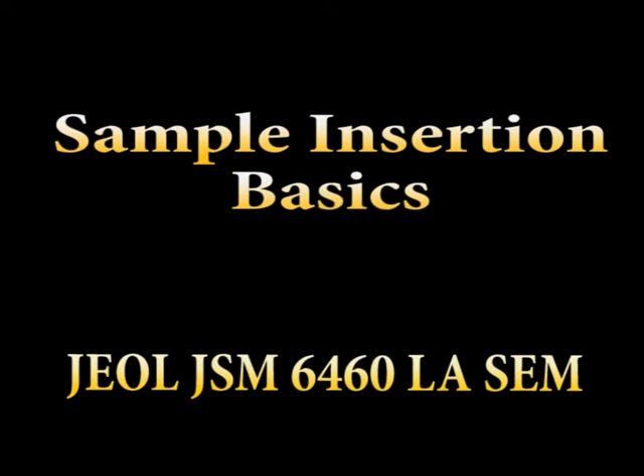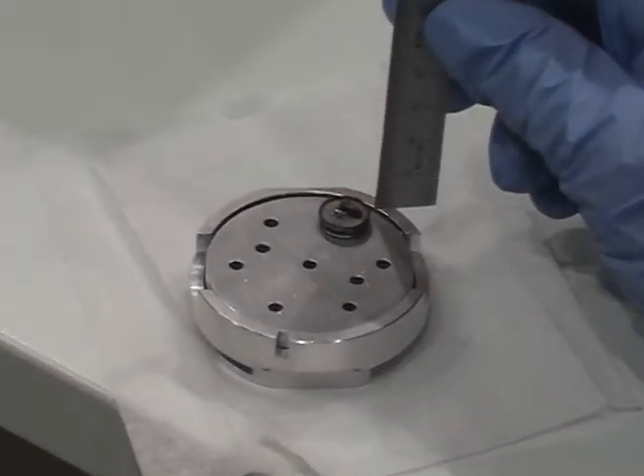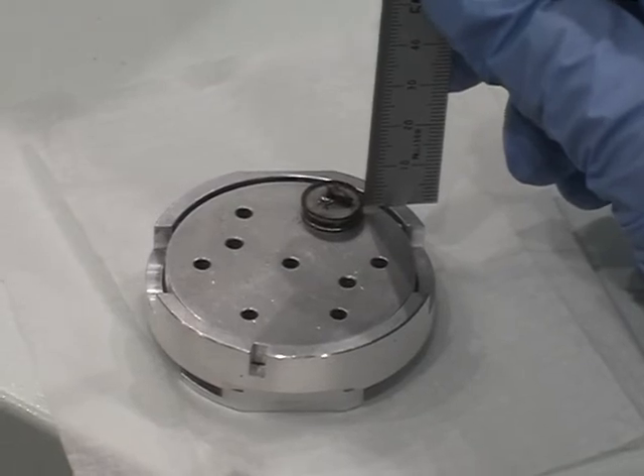Always use clean gloves while handling samples or sample holders. Using a ruler, measure the maximum height of your specimen accurately above the outer rim of the sample holder.